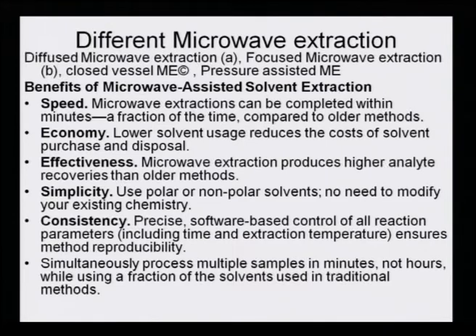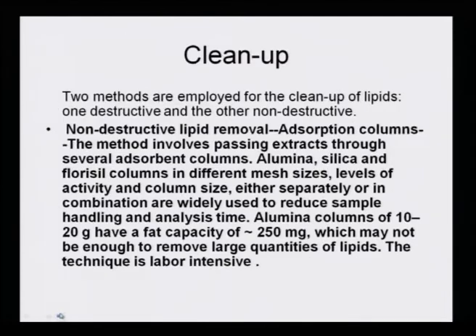Simultaneous processes: multiple samples are extracted in just a few minutes, not hours, while using a fraction of the solvent. Isn't it a better method than traditional methods? Definitely it is a better method. But sometimes we have to remember that there are extractants which have to be cleaned up.